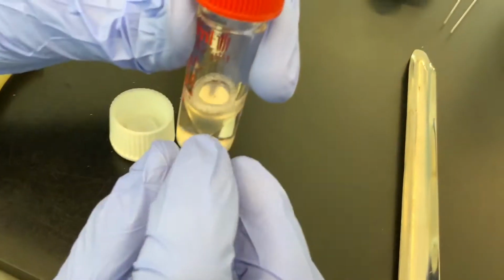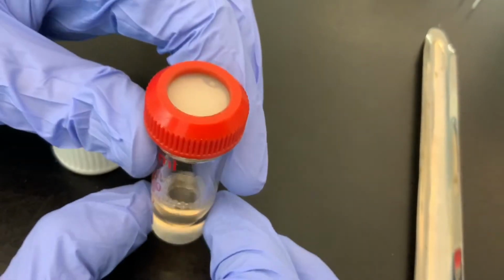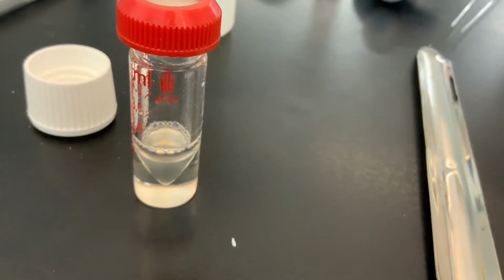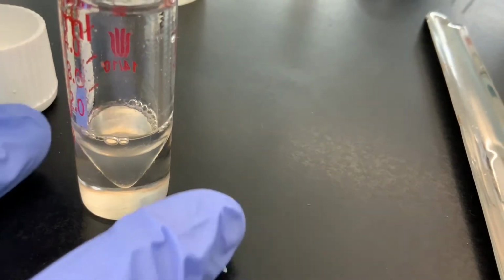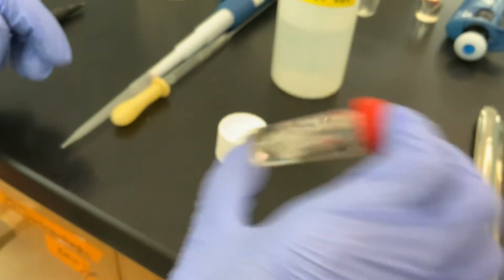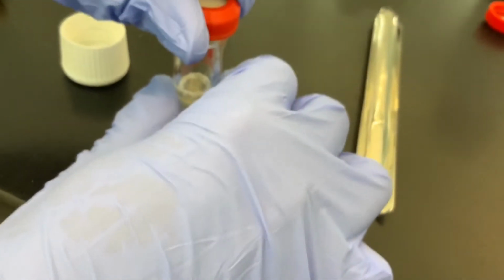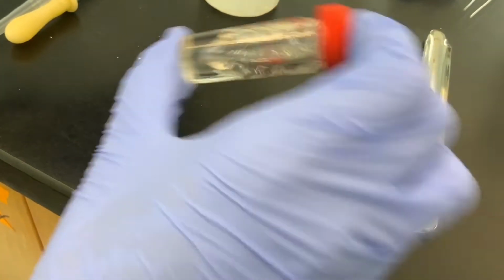All right, and you can observe now that the aqueous layer looks different, and we've got some carbon dioxide leaving the solution, right? And this is at the top of the layer, so it's not the interphase, it's definitely carbon dioxide. So that's one observation that, of course, we would want to examine. Let's give it one more shake for good luck. Oh yeah, no, it's actually still coming out. So I want to do this until I no longer hear the carbon dioxide.